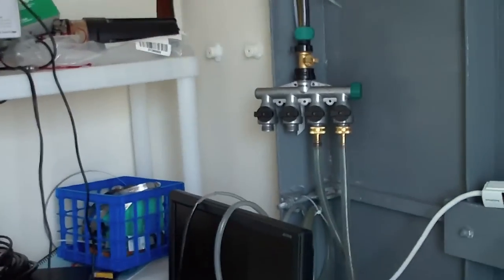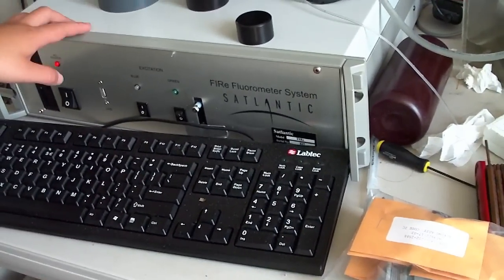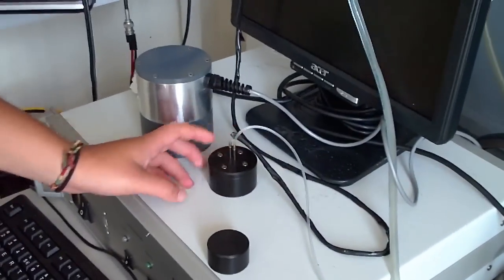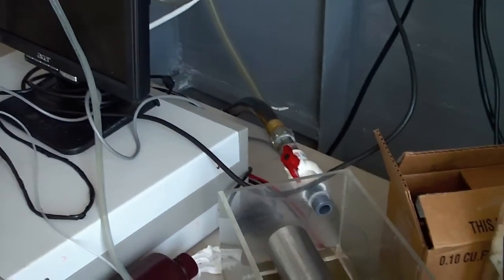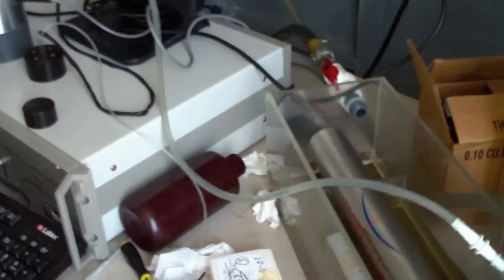Okay. And then the other half goes into the FIRE. FIRE stands for fluorescence, induction, and relaxation. Okay. So what does that do? It's a pump and probe fluorescence measure. What it does is it flashes light and then reads the fluorescence coming back from the phytoplankton. Where does it do that? It does that in here. This is continuous. Water comes out through this little tube here and then goes out through this one, and then we just let it run. Okay, and then it gets pumped right back out into the water. Yeah, and then this is the exit hose, so there's a hole in the back and it just runs back out into the bag.